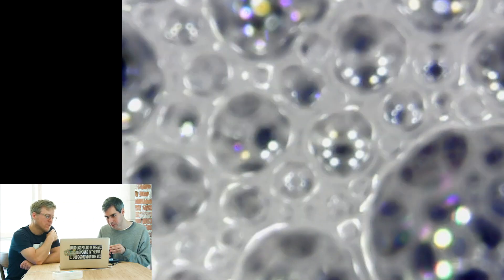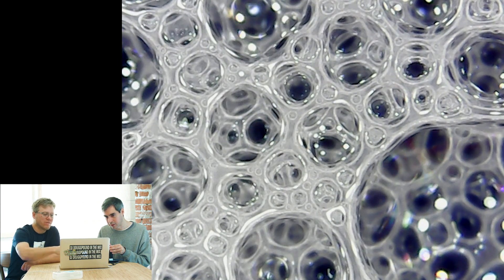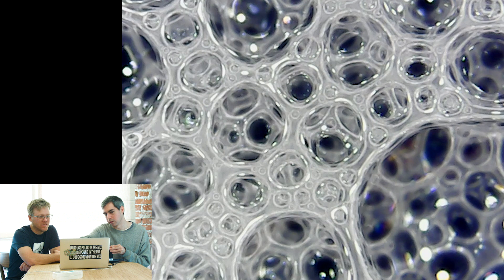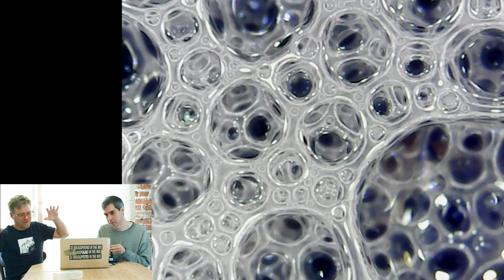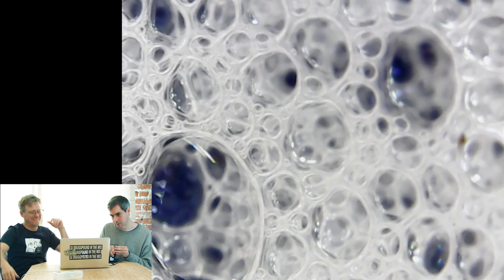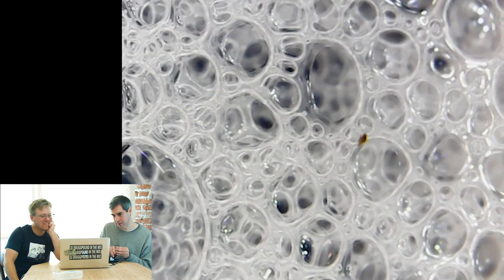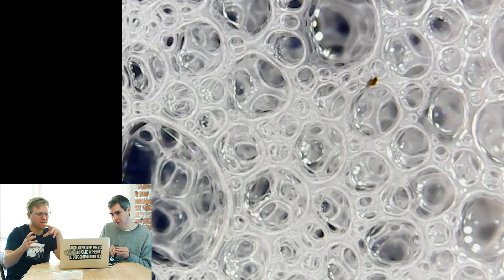I want to get some moving around action here. It looks like a face right there — yeah, it's like a nose and a mouth. Oh yeah. That is cool. And look at how you can sort of see the iridescent sort of swirling that's happening in some of the bubbles. Can you see me in there? No, you can't. Look at these bubbles bubbling around. Oh, now there's a little speck of something. They're replicating — they're doing the opposite of when cells replicate, they join together.